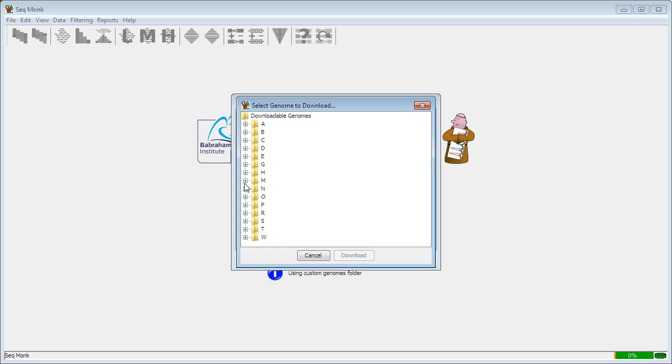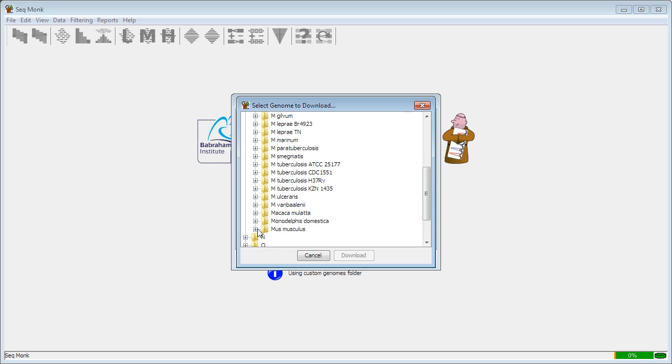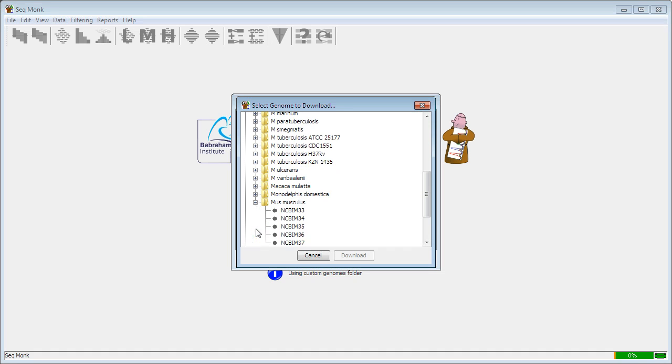You'll see an alphabetical list of available genomes. I'm going to look under M, down to Mus musculus, and then select the correct assembly, in this case NCBI M36.